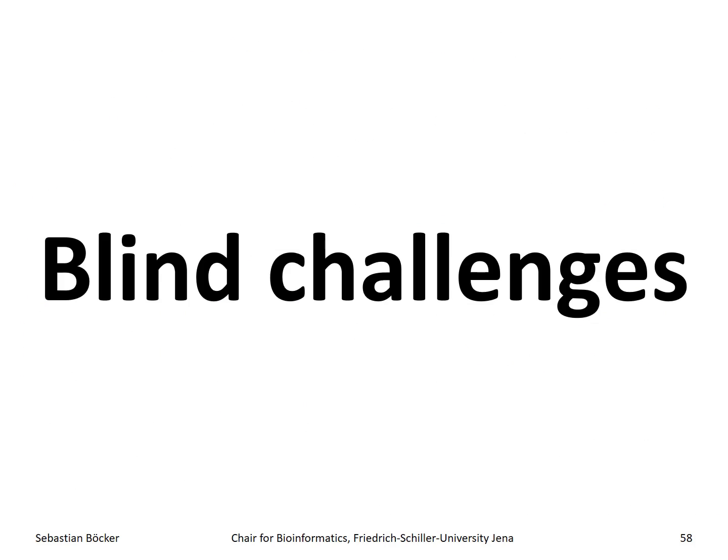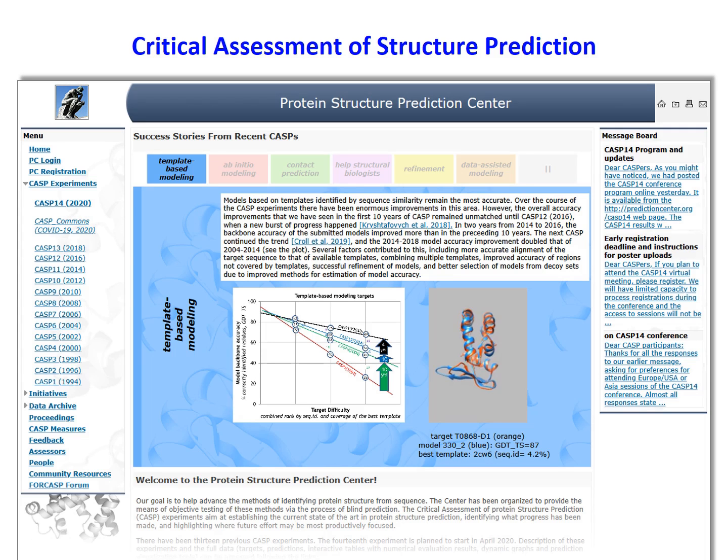But even more convincing than these evaluations which we did ourselves is maybe blind challenges. I mean, the idea of blind challenges is that you get to see data, you don't know the solution, you submit your solution, and only after that you are told whether you were right or wrong, weeks after that. And maybe the best known such blind challenges are critical assessment of structure prediction, the CASP challenges. They have been run now for many, many years, 26 years. That's when they started off.